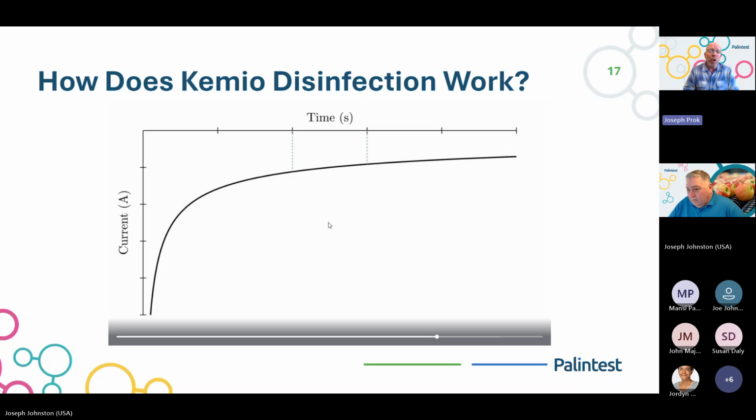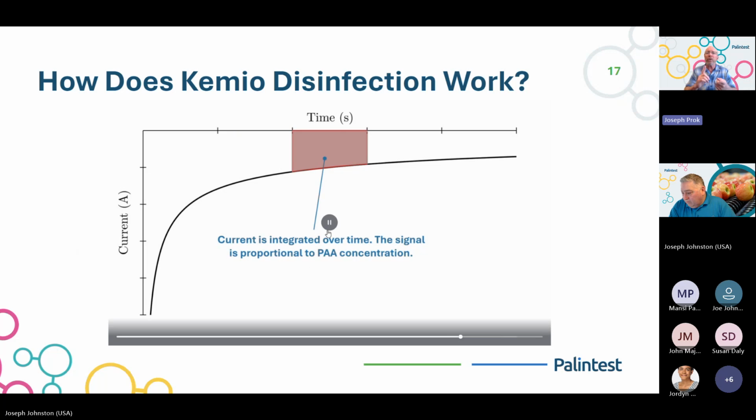When I say small, it's measured not even in milliamps, I believe sometimes in high microamperage. Because we're controlling all the variables in this scenario, including time, the sample volume, the pH in that sample water, and compensating for the temperature, and we also have the known attributes of the applied reagent, we know all 5 of these variables.